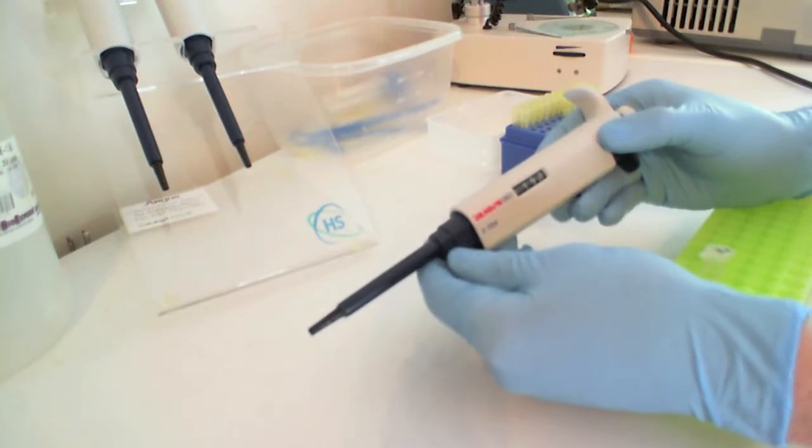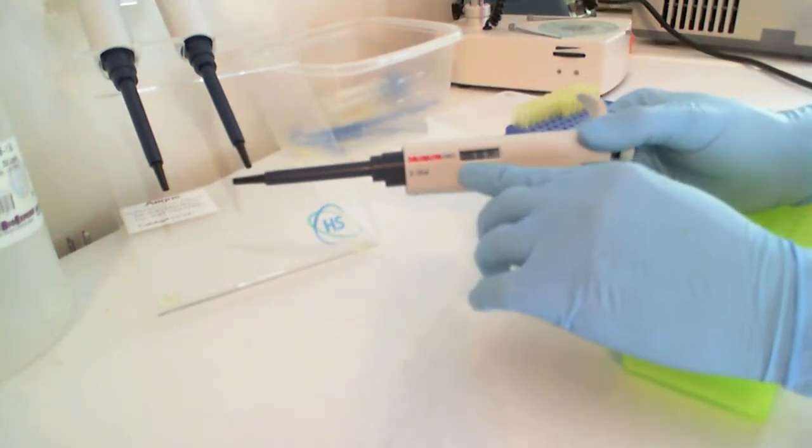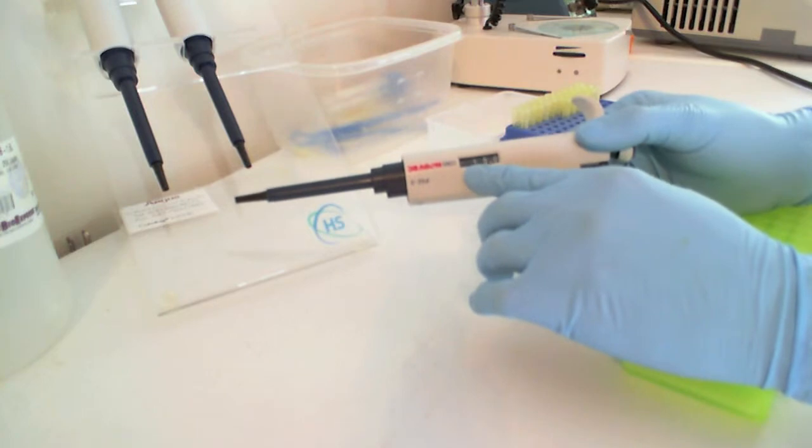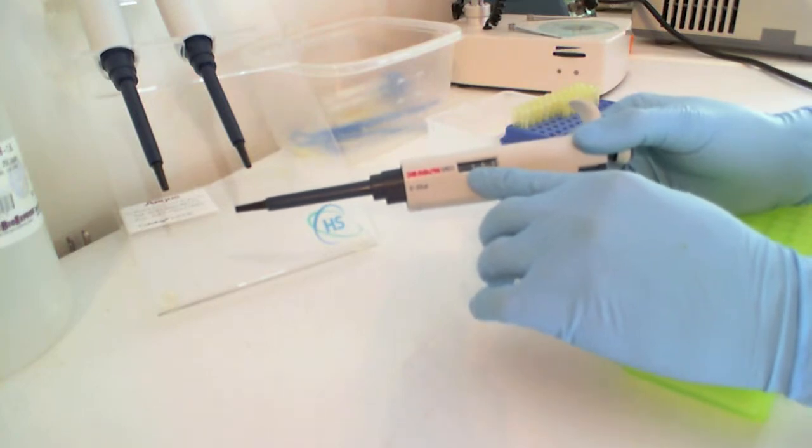Air displacement pipettes move liquids from place to place in pipette tips. They have numbers written here so you can see how much liquid you're going to be moving from place to place.